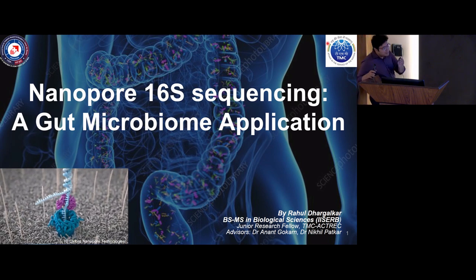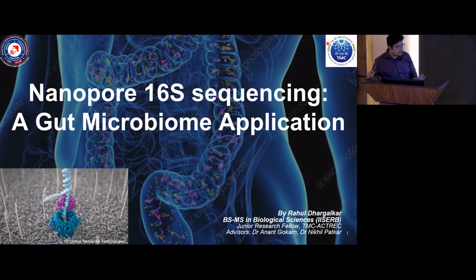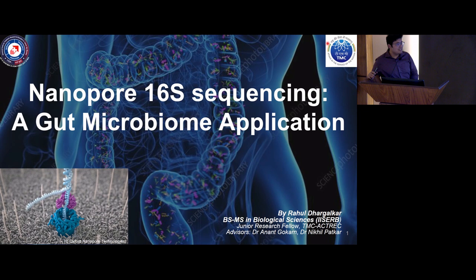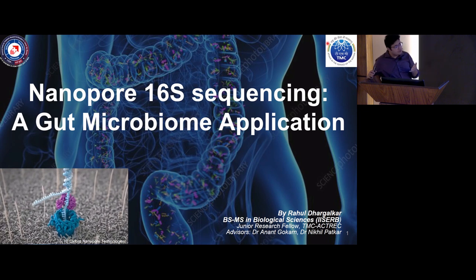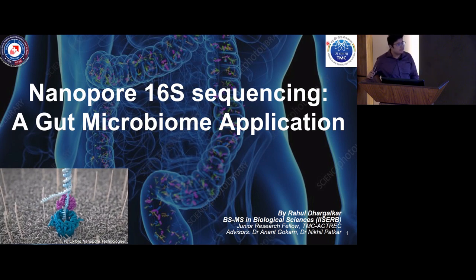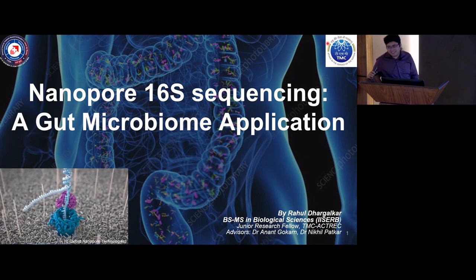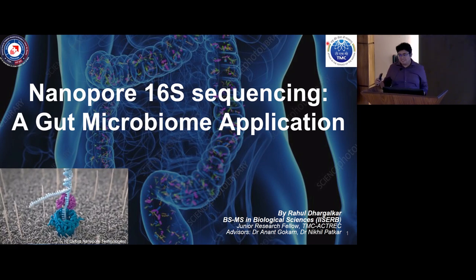That is adaptive sampling, a specific type of target enrichment that can be done, which is not in routine Oxford Nanopore. It's a thing you need to do to enrich your target. It's a strategy which is not applicable as of now. It's applicable, you can use it, but it is not routine. It's like, for example, you can use whole genome sequencing in short read, and you can target enrich as well. To give you an example, this is done using a bed file as to what you want to enrich, and the ONT will work there.